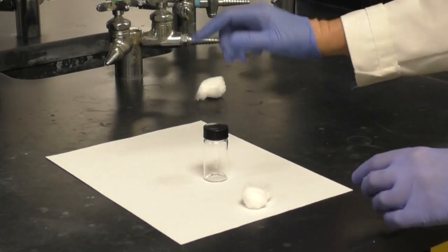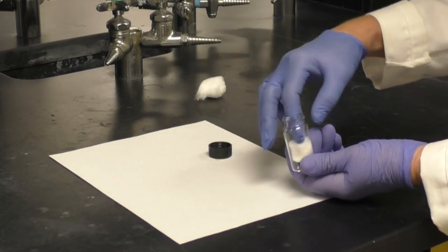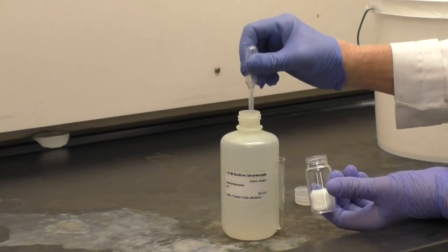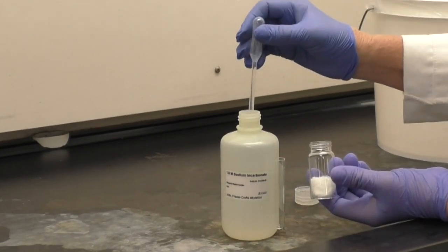Using a 20 milliliter glass vial, tear a cotton ball in half and add it to the vial. Then add 1 molar sodium bicarbonate until the cotton is saturated.